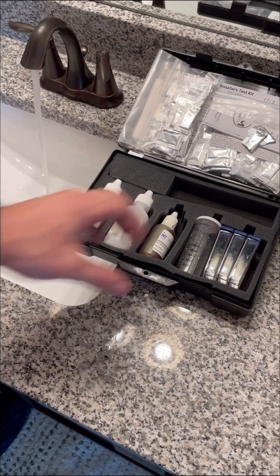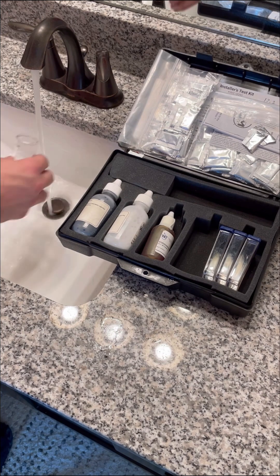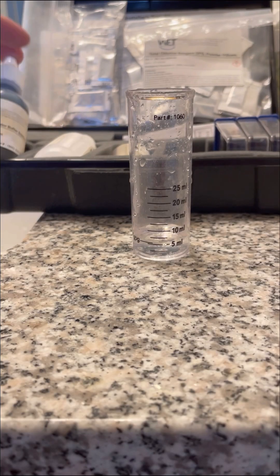Have you ever heard of hard water? In this video we're going to be testing the water in this customer's home to determine its hardness. Water hardness refers to the amount of dissolved calcium and magnesium in the water. There are a few different methods for testing water hardness.